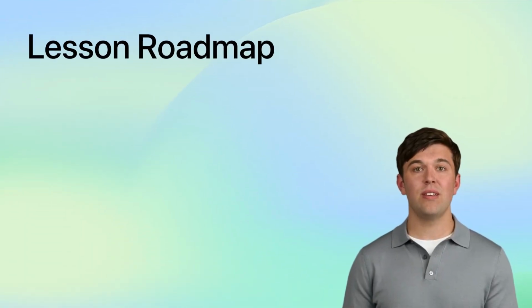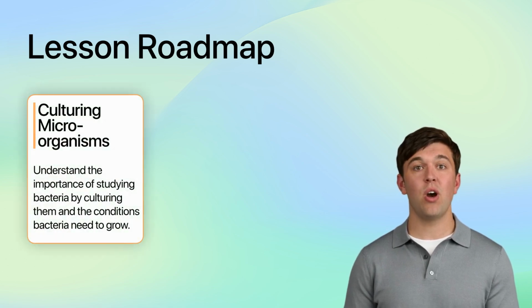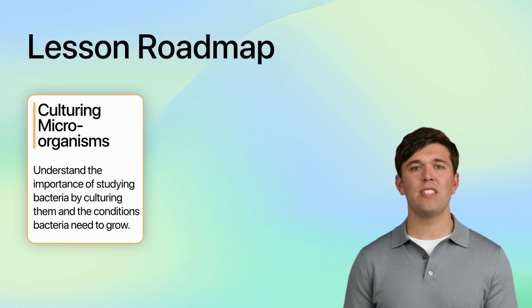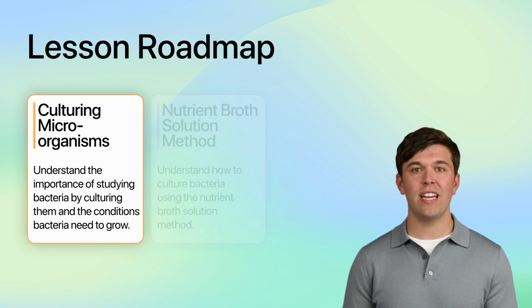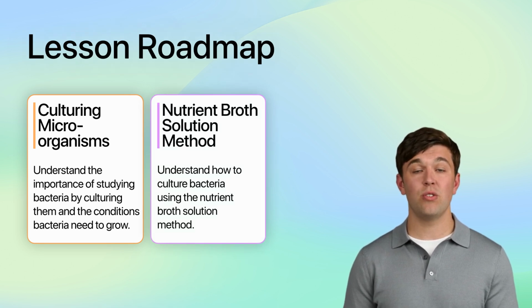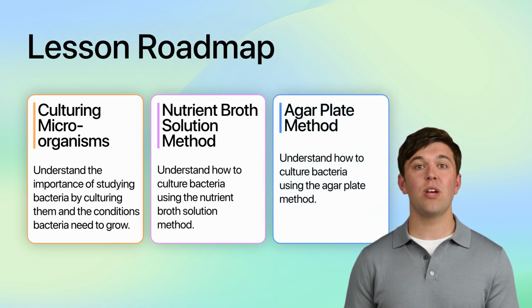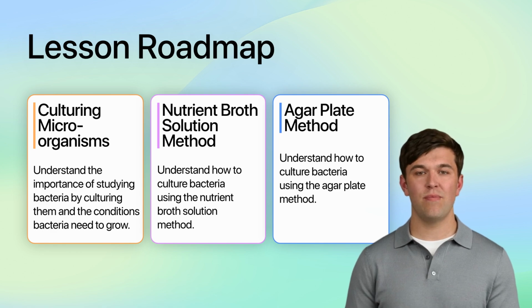In today's lesson, we will firstly introduce the importance of studying bacteria by culturing them and understand what bacteria need to grow. Secondly, we will understand how to culture bacteria using the nutrient broth solution method. Finally, we will learn about how to culture bacteria using the agar plate method.